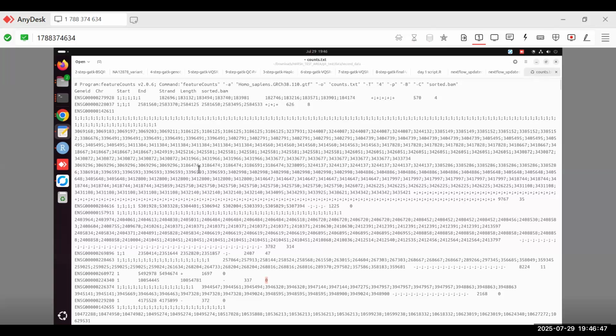So tomorrow, we are going to use the same tools itself, but instead of executing each command one at a time like we did here, we are going to make a script entirely, a .sh script. It's a bash script, and we are going to have all the commands in it all together, and we are just going to give one single command, and using that your entire analysis will be completed in one go.